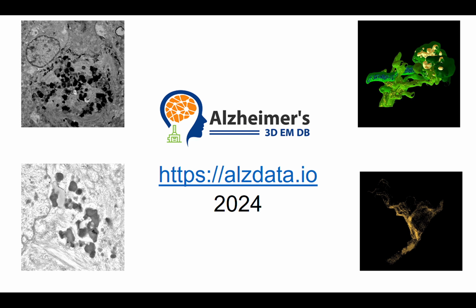Welcome to our virtual tour of alzdata.io, a new resource for interactively exploring electron microscopic image data of rare and highly preserved human brain biopsy samples from Alzheimer's disease patients. Throughout this video, we will guide you through the main pages of the website.